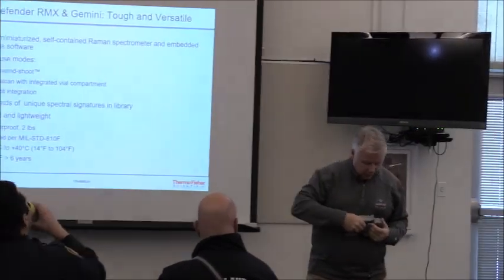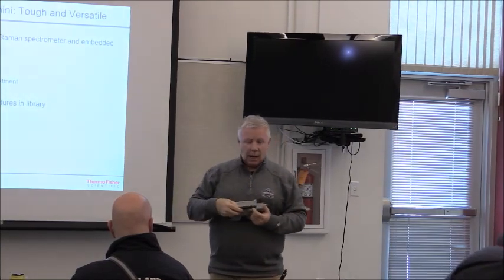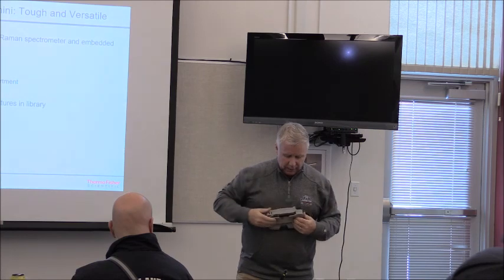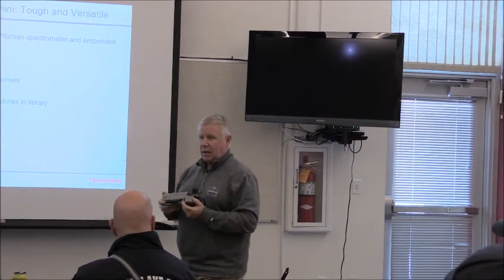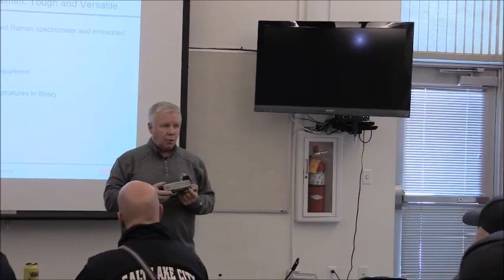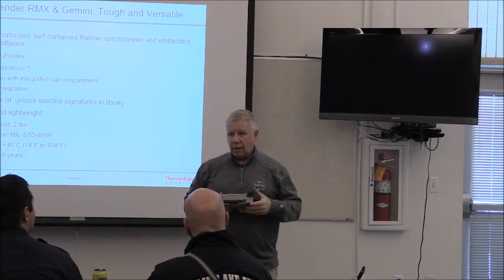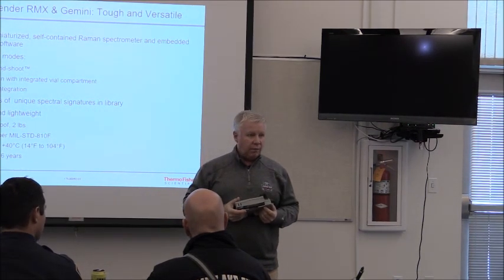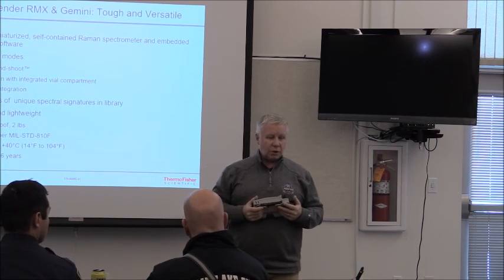And if you notice, there's a little yellow band on the probe. When that gets inserted, if I put it like that, where I can see the yellow band, the probe is not inserted fully, which means the focal point will not be correct. That band must disappear. It must visibly go away. So you can pull that little probe out. Just keep that in mind.